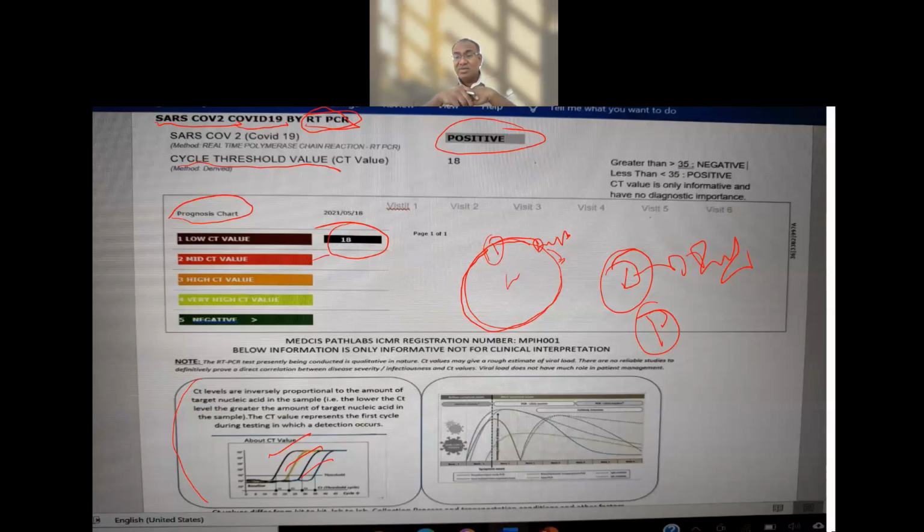So when it doesn't have any color, I need to add something to give it some color. So I use some dyes, the fluorescent dyes. I call it a quencher. I call it a reporter. I'll tell you that within a span of 1 or 2 minutes.